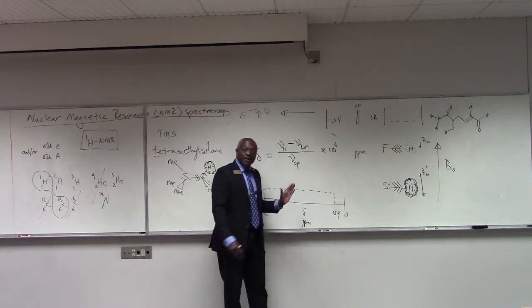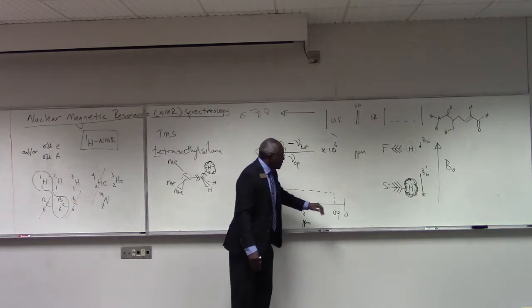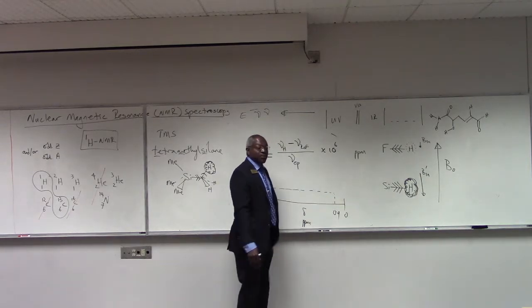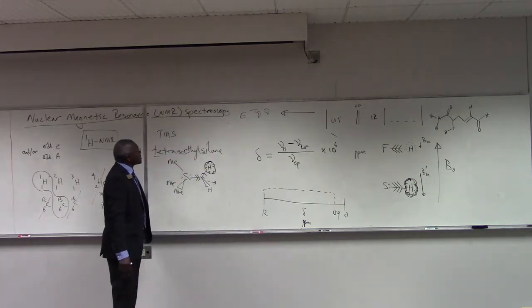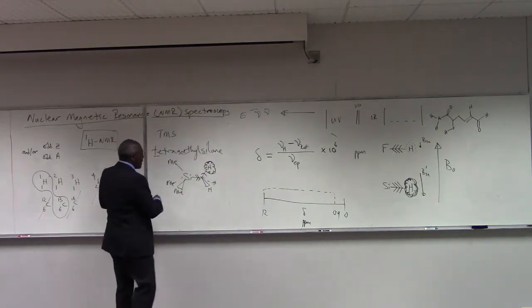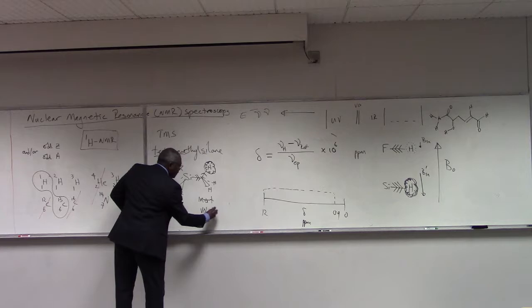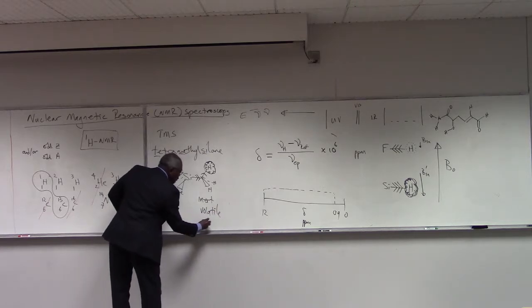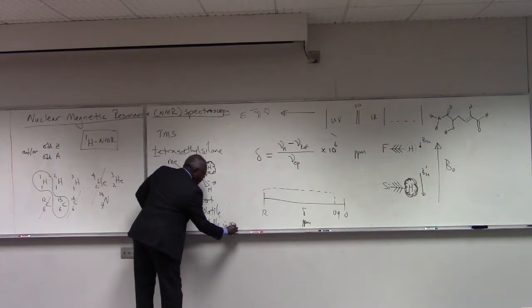It's free and clear of all the typical protons in organic compounds, so I can run the spectra with TMS with impunity. The other reasons we use TMS is because TMS is inert. It is inert and it is volatile. And really it is also soluble in a range of organic solvents.